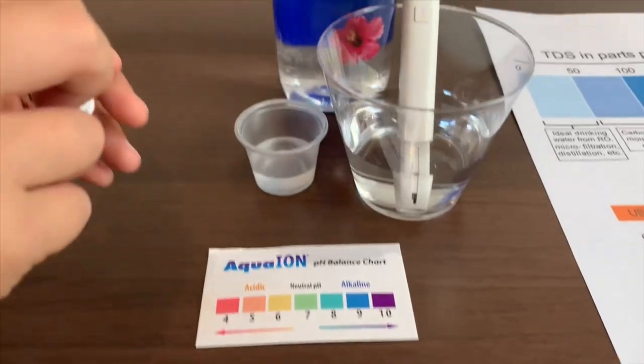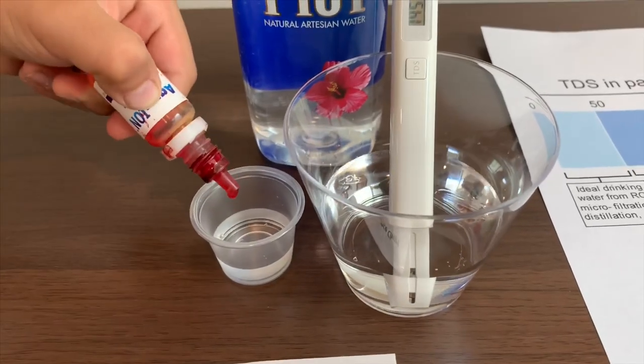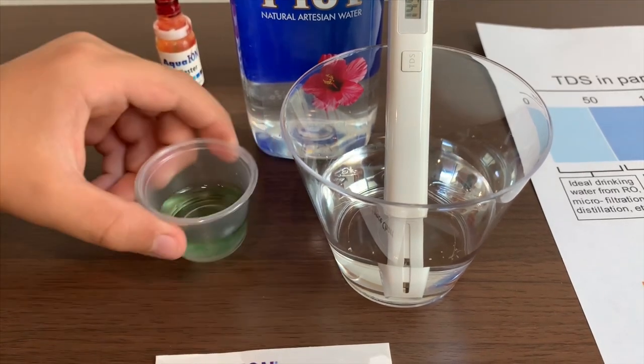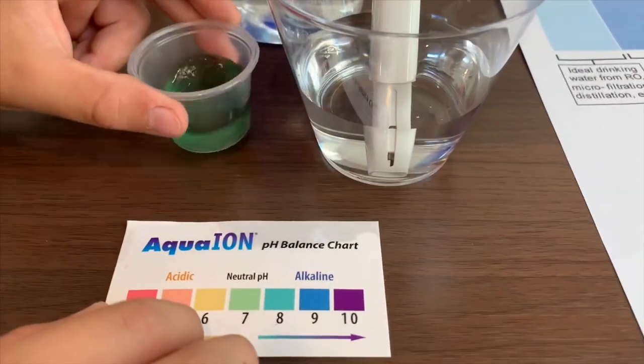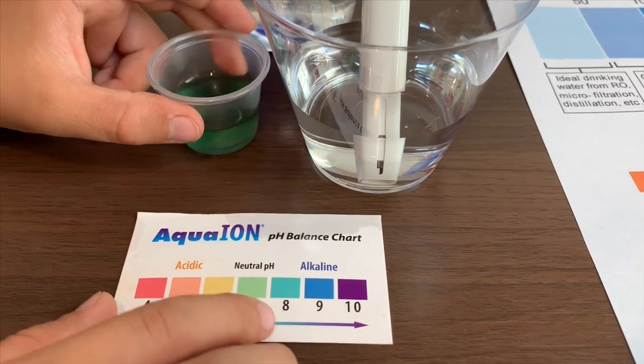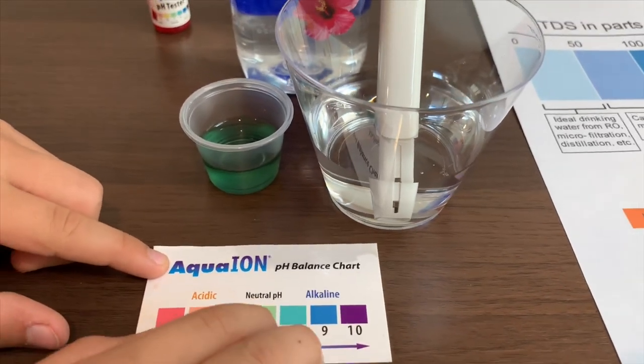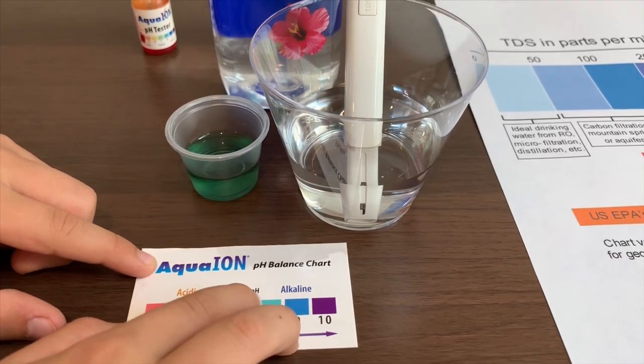Now let's test the pH. We're going to do two drops. It is a little darker than 7, so it is a 7.5. That's neutral pH.